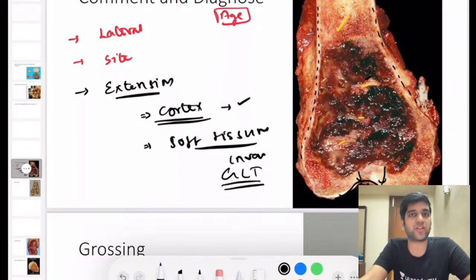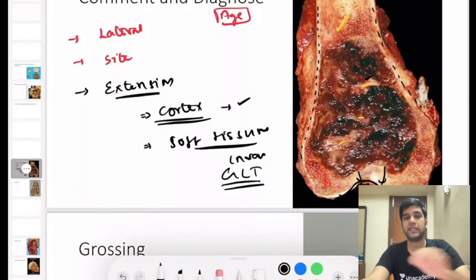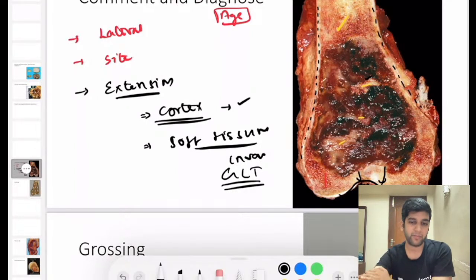My differential diagnoses are these. This is how you're going to end for any bone lesion. The differential diagnosis should always be based on the age of the patient, and I do want the radiographic findings and also the location of the origin to comment further, right? ABC is a bit unlikely in this situation, but ABC might still be a possibility and could be an easy differential diagnosis. But first, for a 35-year-old, I will put GCT first, then maybe ABC and other cystic lesions of bone.